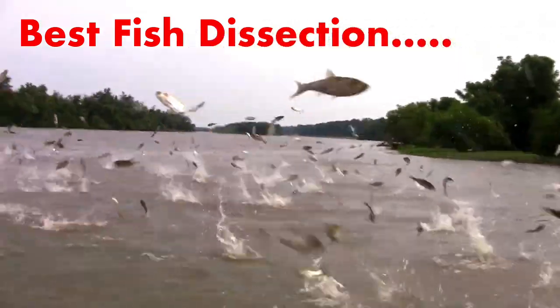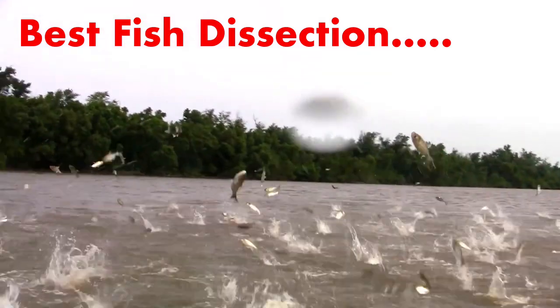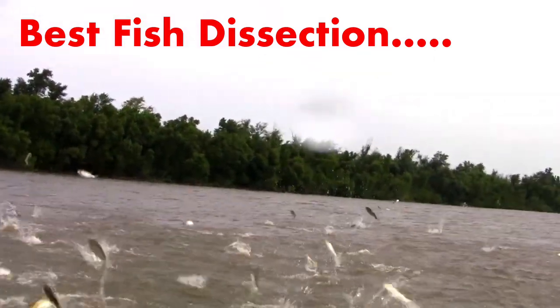Today we're looking at the bony fish anatomy of a carp — not just any fish, but the silver carp, an Asian carp best known as the invasive jumping fish.